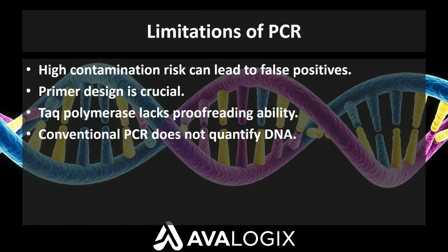Primer design. The success of PCR depends heavily on the primers. If primers are not specific enough, they may bind to unintended sites, leading to non-specific products or primer dimers. Designing primers requires knowledge of the target sequence, melting temperatures, GC content, and absence of secondary structures.